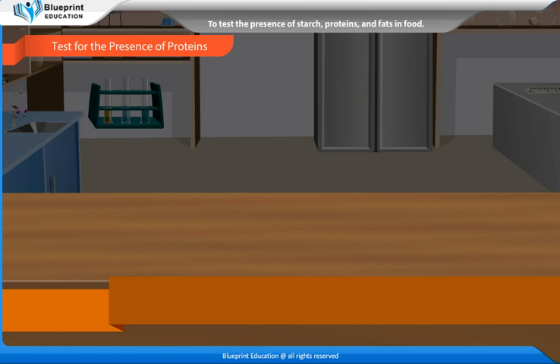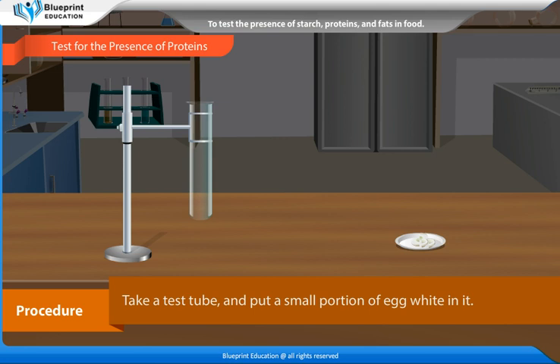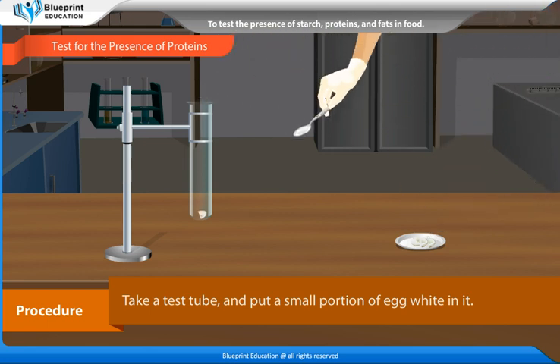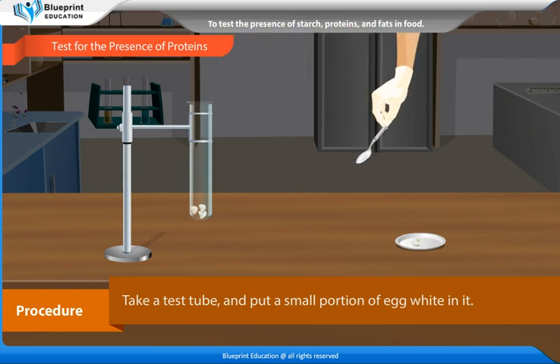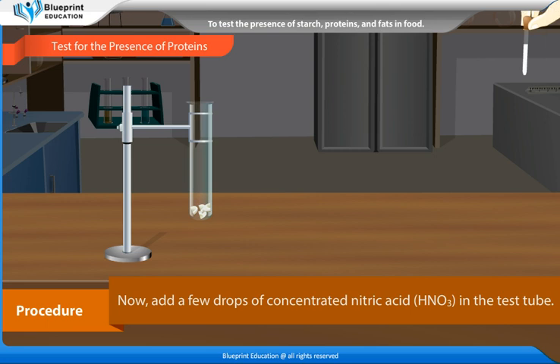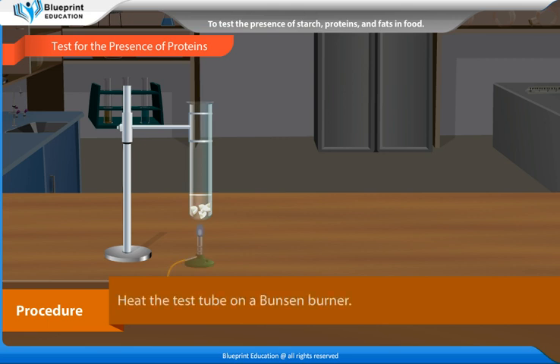Test for the presence of proteins. Procedure: Take a test tube and put a small portion of egg white in it. Now add a few drops of concentrated nitric acid in the test tube. Heat the test tube on a Bunsen burner.